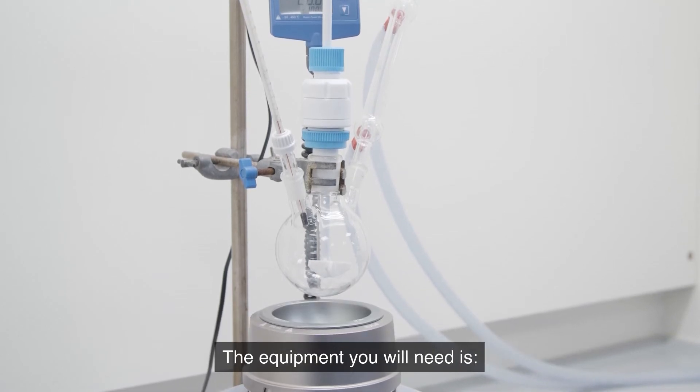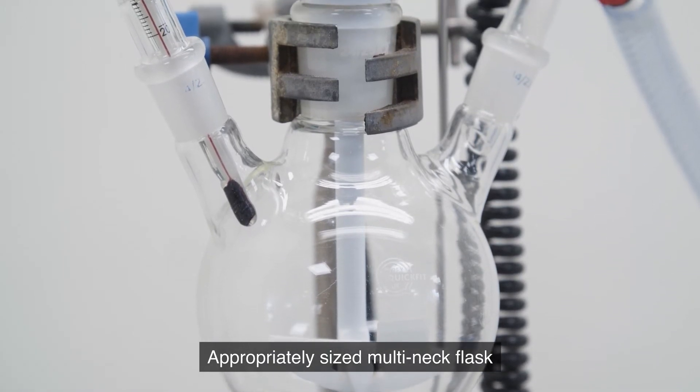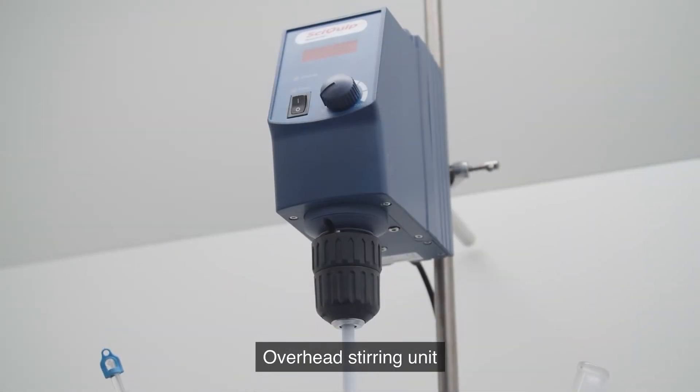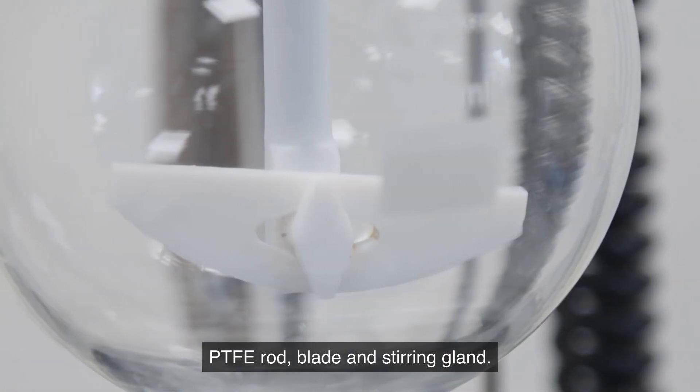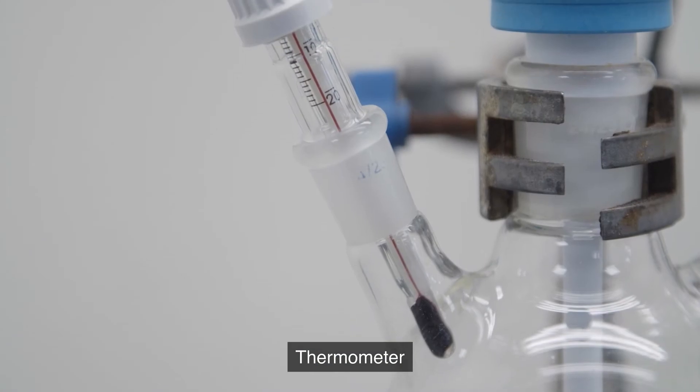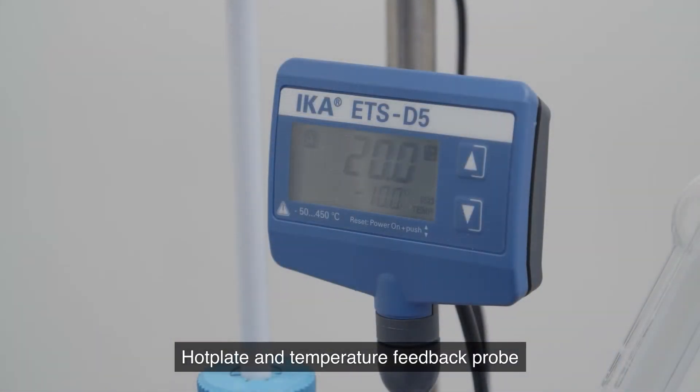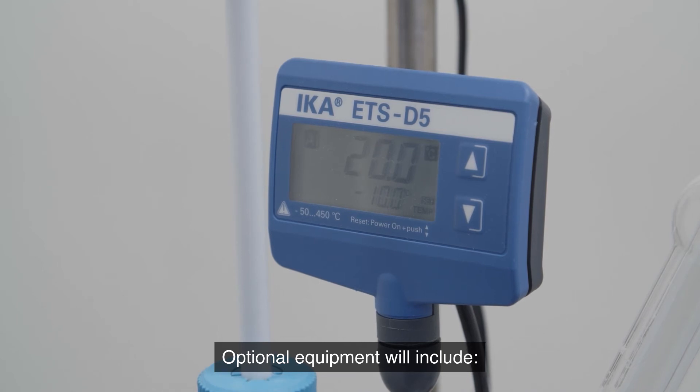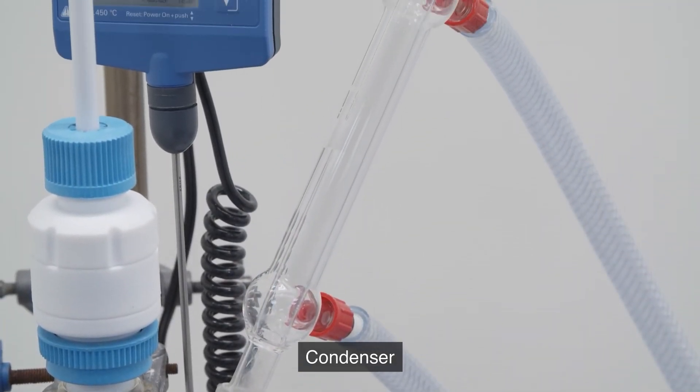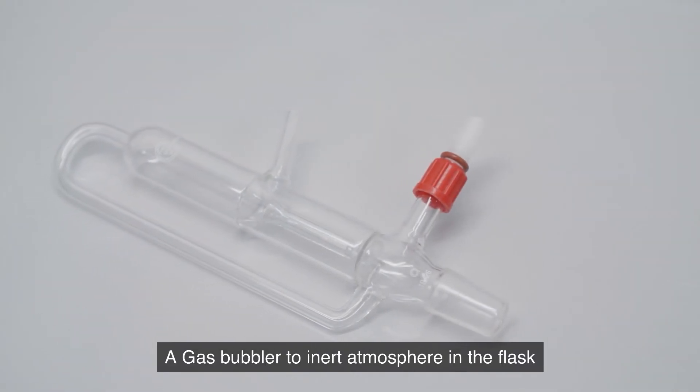The equipment you will need is appropriately sized multi neck flask, overhead stirring unit, PTFE rods, blade and stirring gland, thermometer, hot plate and temperature feedback probe. Optional equipment will include condenser and a gas bubbler to inert the atmosphere in the flask.